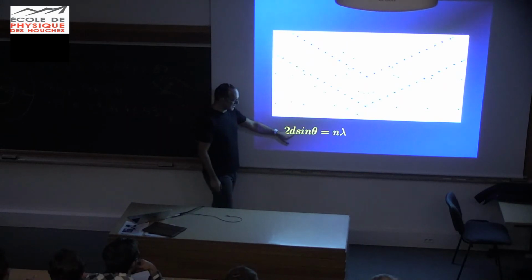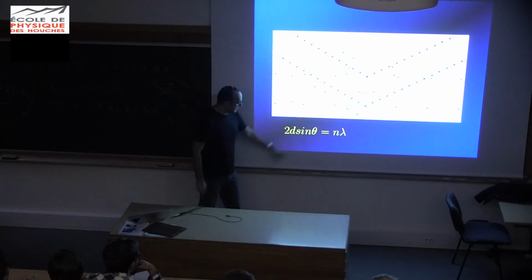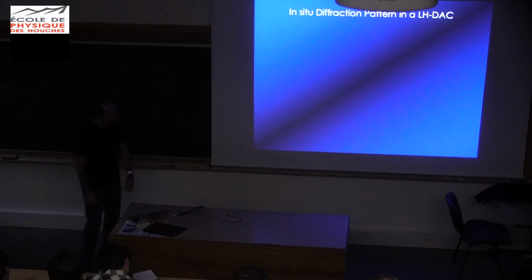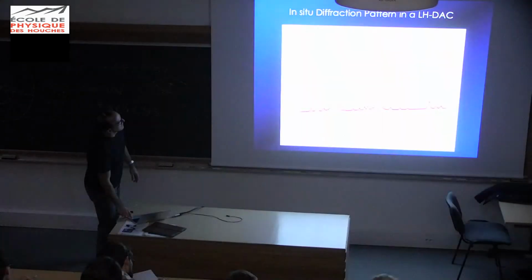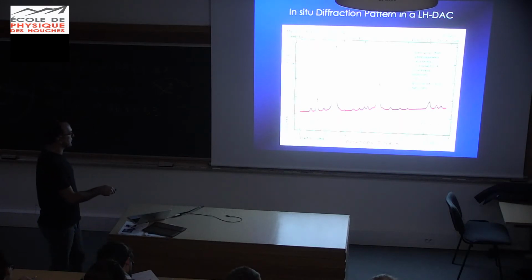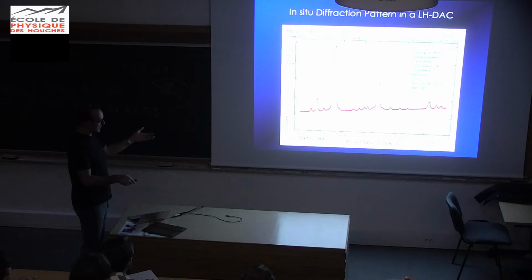So this is the interatomic spacing. This is the wavelength of your X-ray. N is always equal to 1, and theta is the angle that you're looking at, okay? And that's what a spectrum looks like. So that's your angle here, 2 theta. It's theta in the equation, and they always plot it as 2 theta.